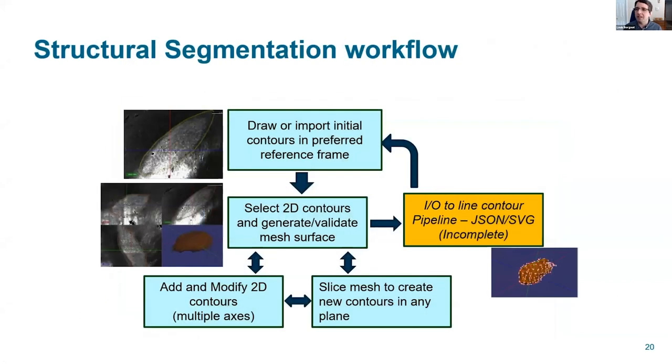So back to some of the slides. This is really the same expression of what we've been describing, and that probably users should be talking more about in terms of how A3D can be used to build atlases and delineate structures and improve the quality of other structural mapping. So it's really that idea of iterating between meshes and work.